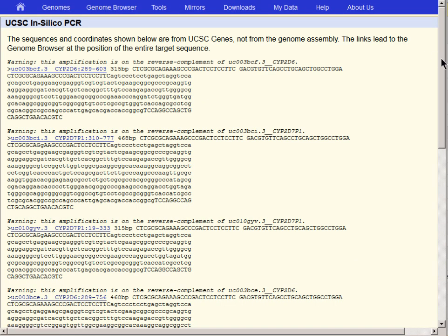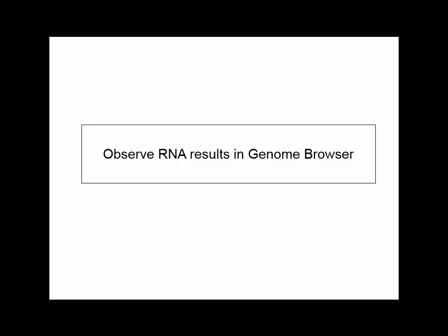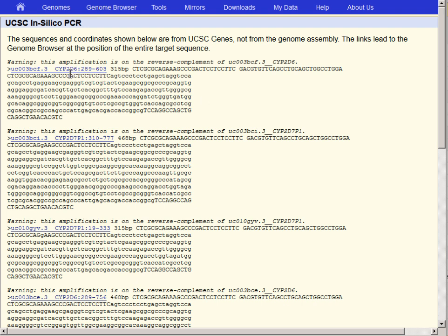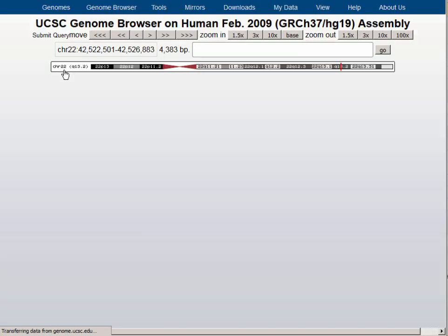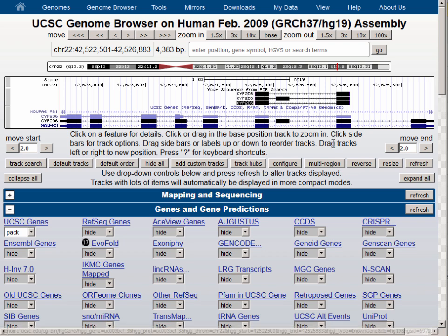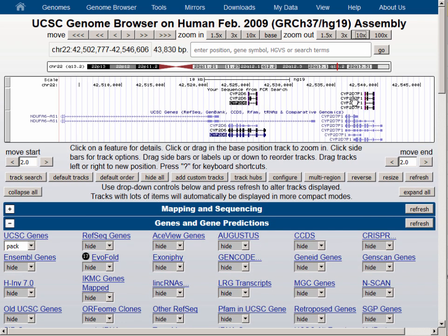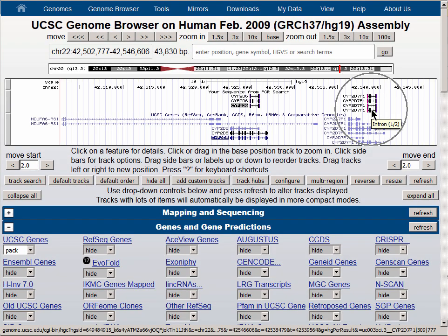Now on this results page, you'll notice that we have multiple results. We did expect to find at least the CYP2D6 and the CYP2D7 pseudogene because of our earlier result with these primers, and we'll also notice that we have multiple hits for each of these. Notice also that the CYP2D6 amplicons are 315 base pairs and 468 base pairs in length. Let's click into the upper CYP2D6 amplicon and navigate to the Genome Browser to see that we actually have three annotations of two different types representing the three isoforms of the gene, each as a separate amplification product — one includes the intervening exon and the other two do not. By zooming out by a factor of 10x, we see that the CYP2D7 pseudogene actually has four predicted amplicons using the primers that we selected, corresponding to the four isoforms of this gene.